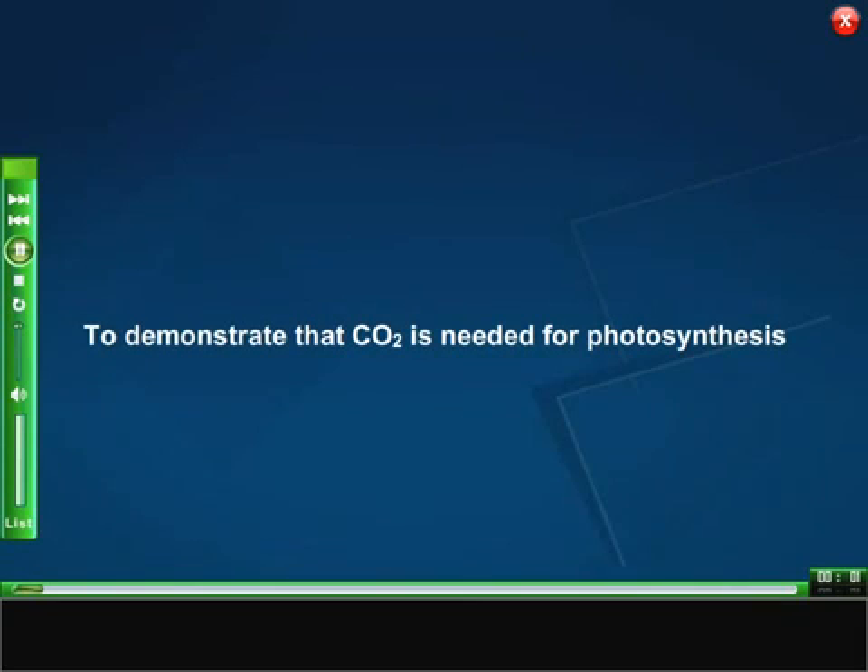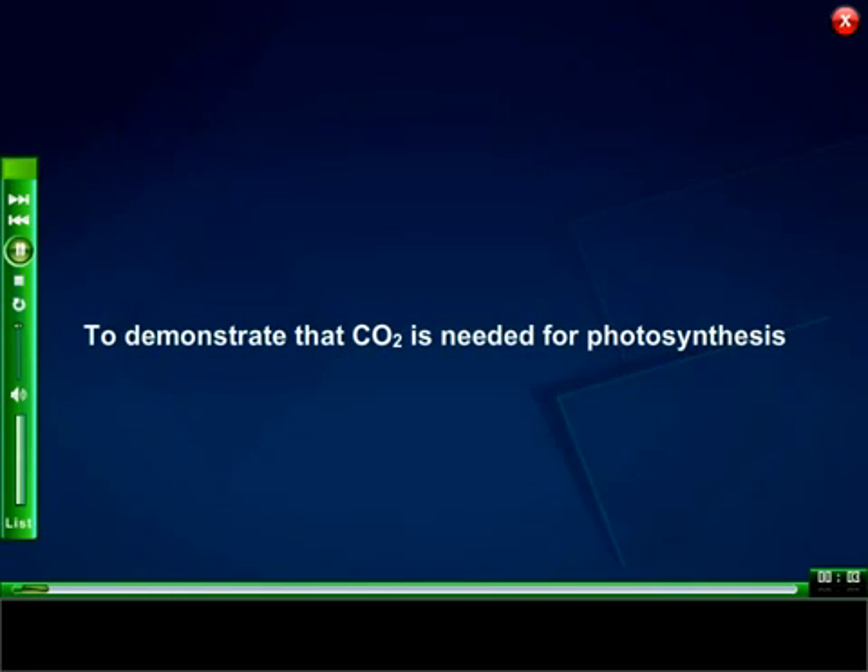To demonstrate that carbon dioxide is needed for photosynthesis.